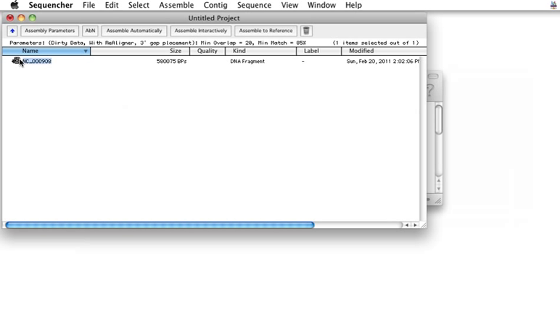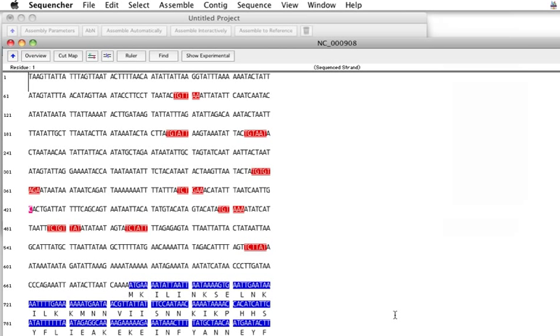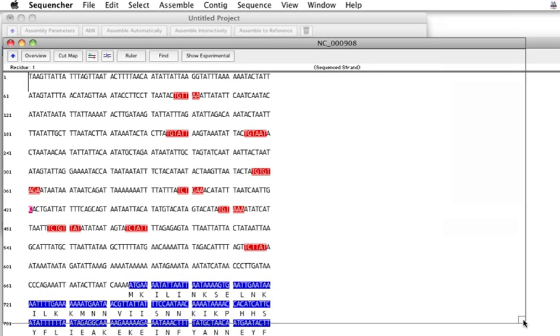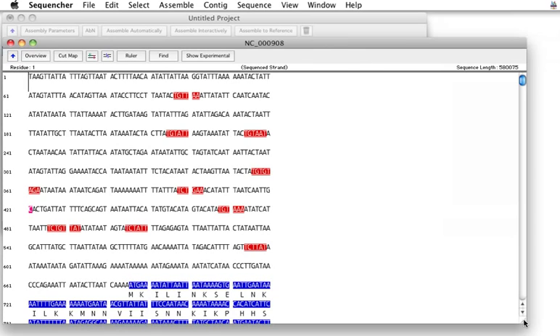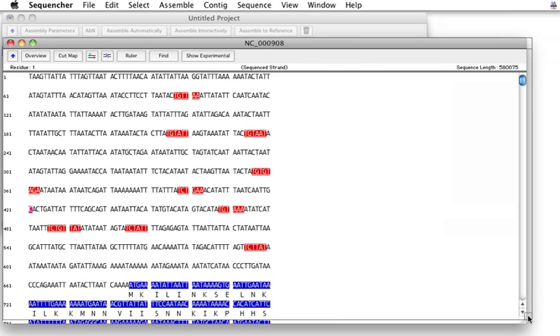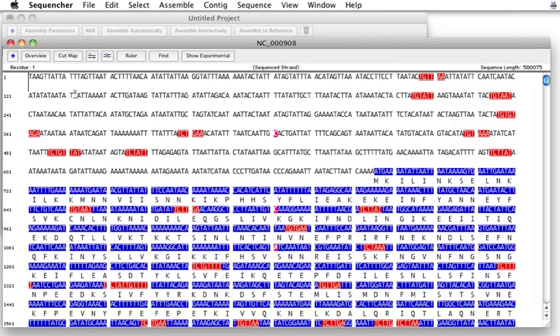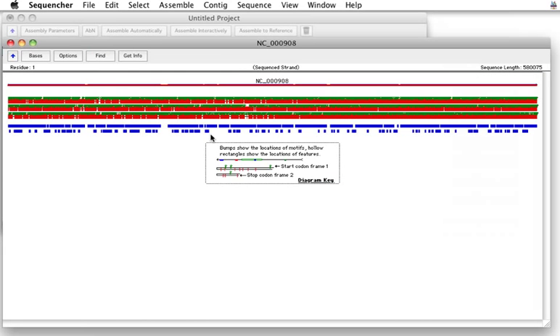Instead of loading hundreds of thousands, in this case, or millions of reads into the Sequencher project window to scroll through, I'm going to tell Sequencher where to find the next-gen data to align to this reference sequence. This reference is just right out of GenBank with all of its annotations. So it has all the features marked that you would expect.